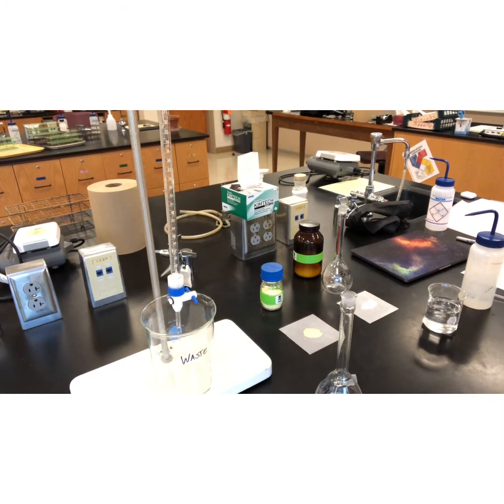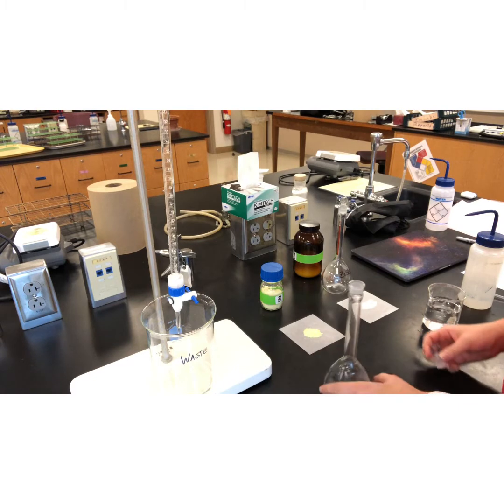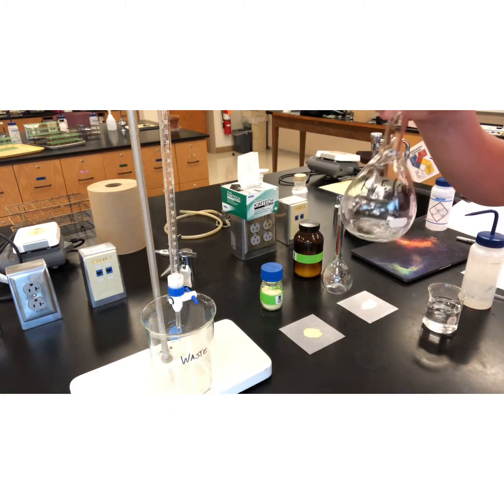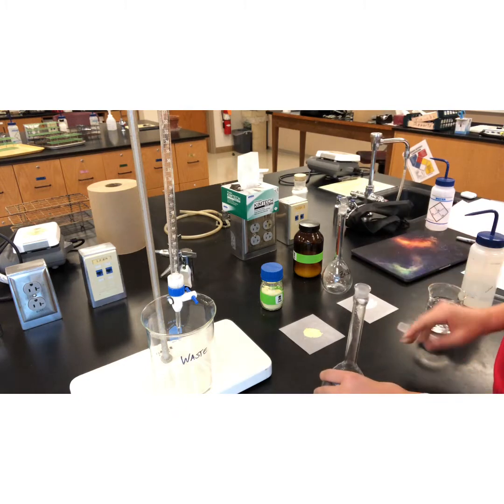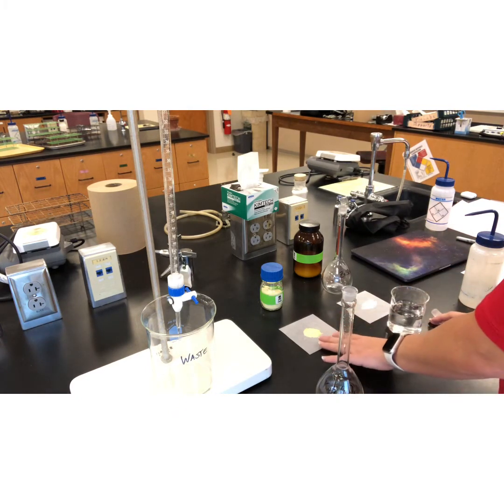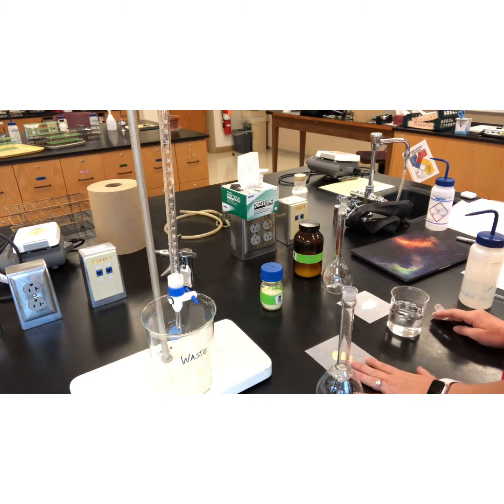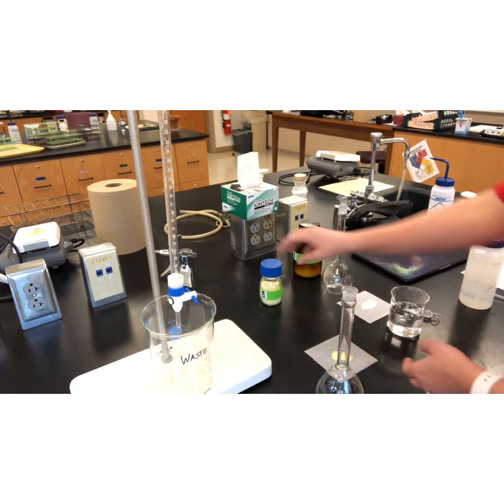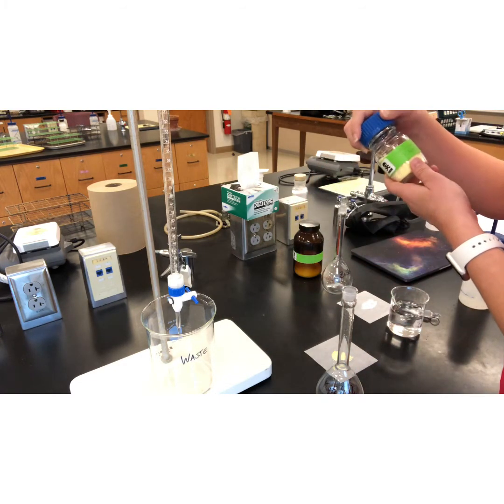Okay, I'm back. I went and grabbed the thing I needed. So we've got our volumetric glassware, our volumetric flask. I've already put a little bit of water in the bottom just to make sure it would pour out of my beaker nicely. I've got my weighed-out mass of the potassium ferrocyanide trihydrate.